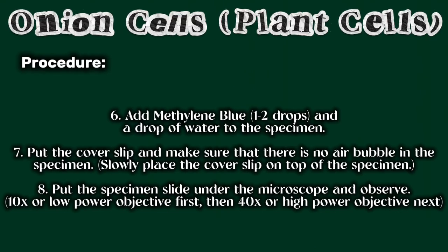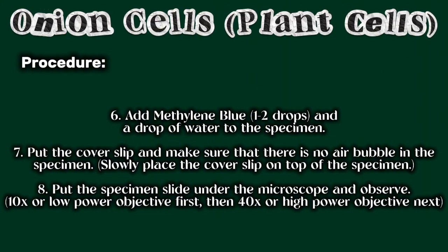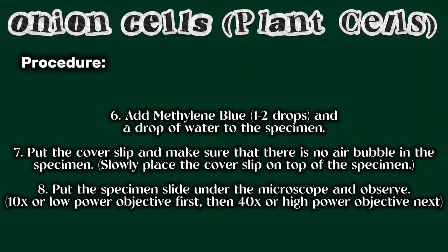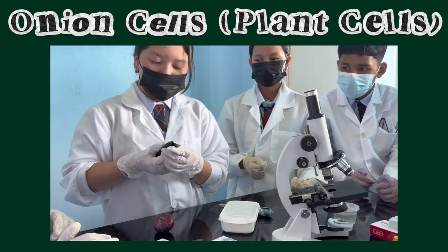Put the cover slip and make sure that there is no air bubble in the specimen. Slowly place the cover slip on top of the specimen. Put the specimen slide under the microscope and observe. 10 times or low power first, then 40 times or high power next.